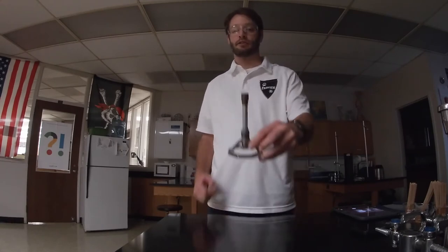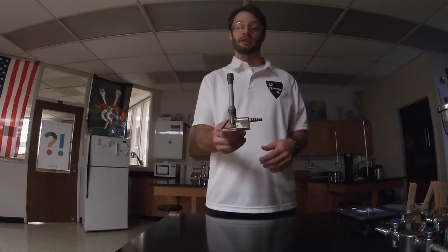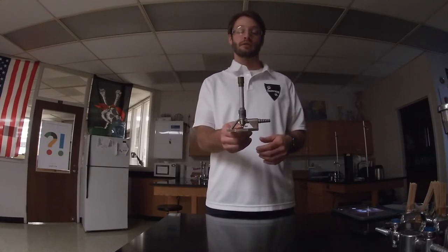This video is to show you how to properly use a burner. In this case, we have a Tyrell burner, but Bunsen burners are also widely used.